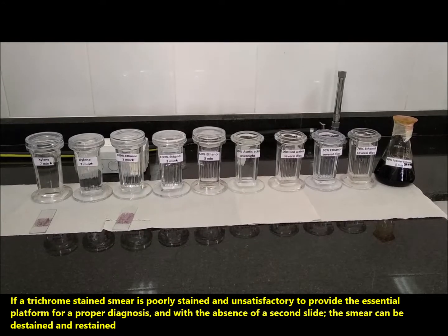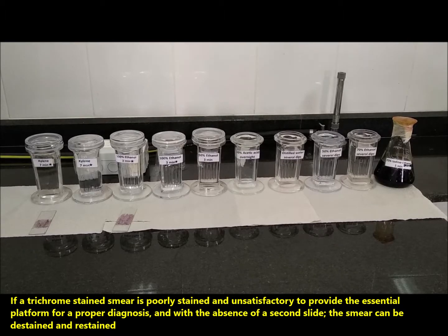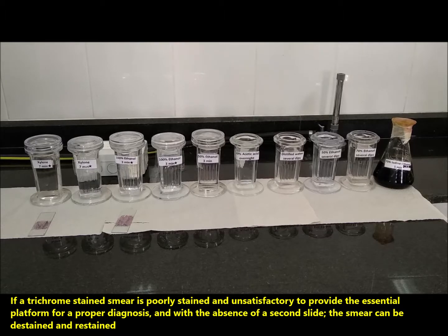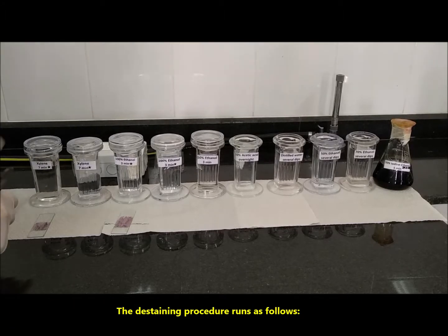If a trichrome stained smear is poorly stained and unsatisfactory to provide the essential platform for proper diagnosis, and with the absence of a second slide, the smear can be de-stained and re-stained. The de-staining procedure runs as follows.